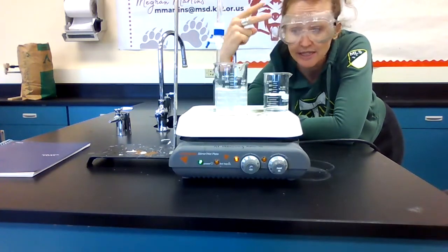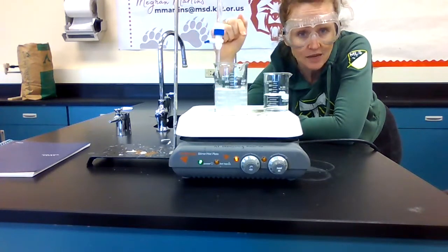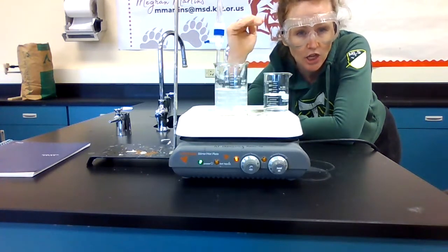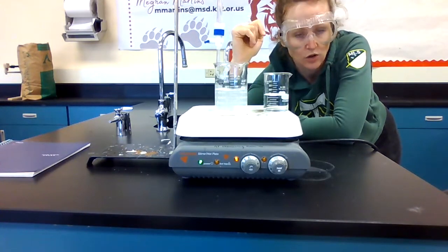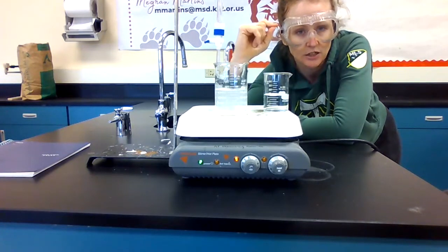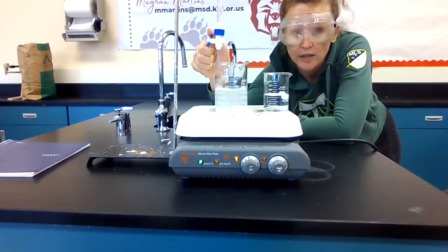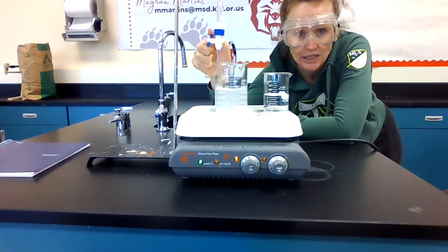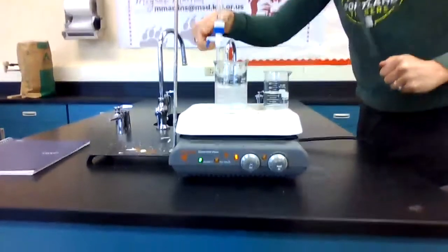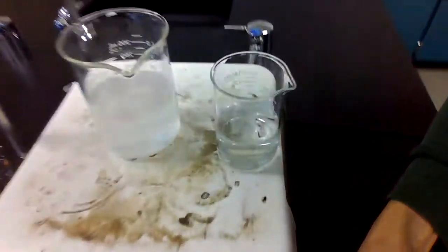So then you're going to run a titration a second time. And then the second time you run it, you let the base in until it gets close, and then you go drop by drop by drop by drop to get your very specific amount. So most times when you do a titration, you're going to run the titration at least 2 times. Let me get the camera close here so you can see what's going on. Again, as soon as we see a color difference, we are done.